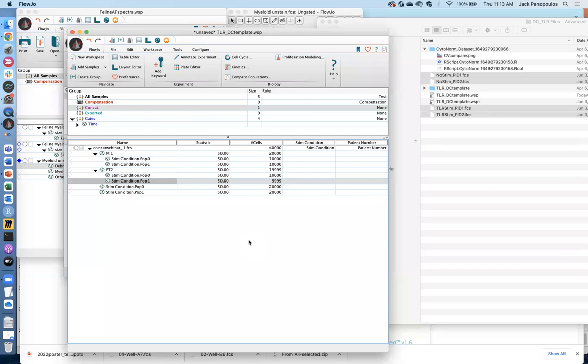So that control has to have those 5 peaks, and then hopefully the test sample has only 5 peaks or less. Right? If you expect that you're going to have 7 peaks across 2 channels, then you need to have a portion of a sample that has those 7 peaks represented. Does that make sense?